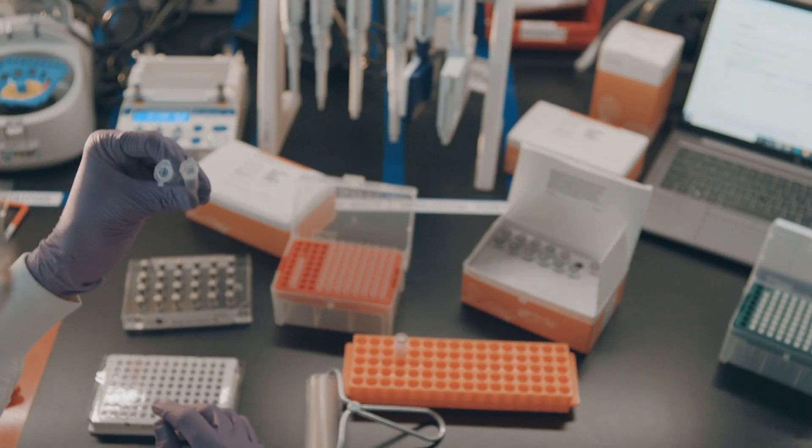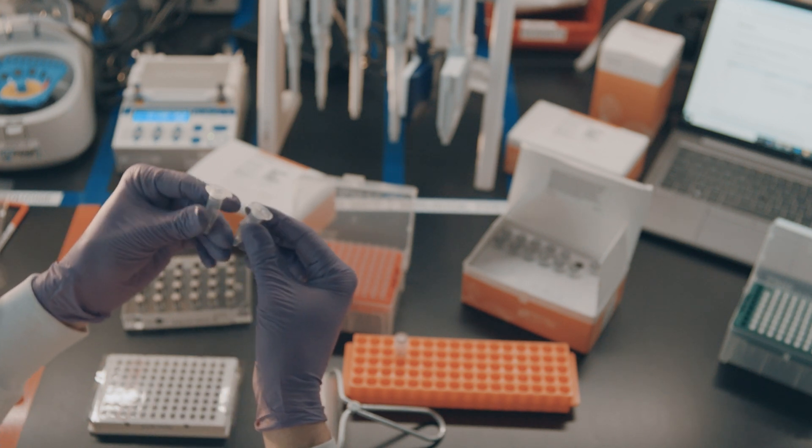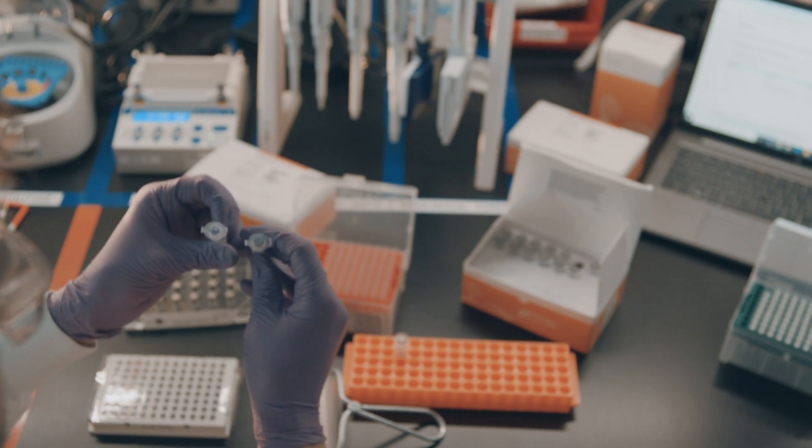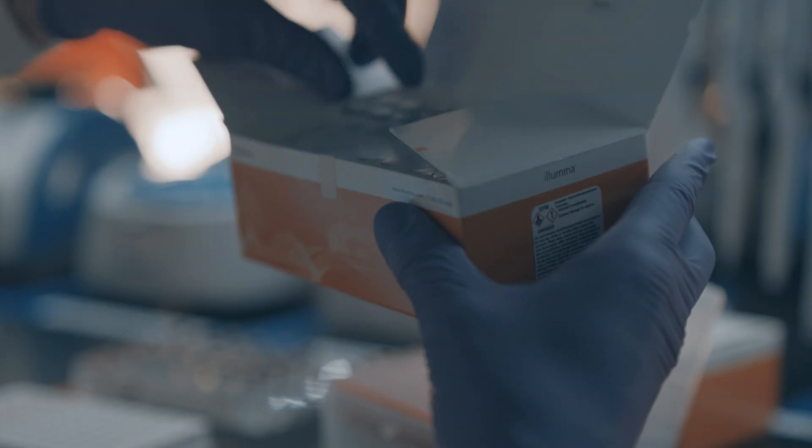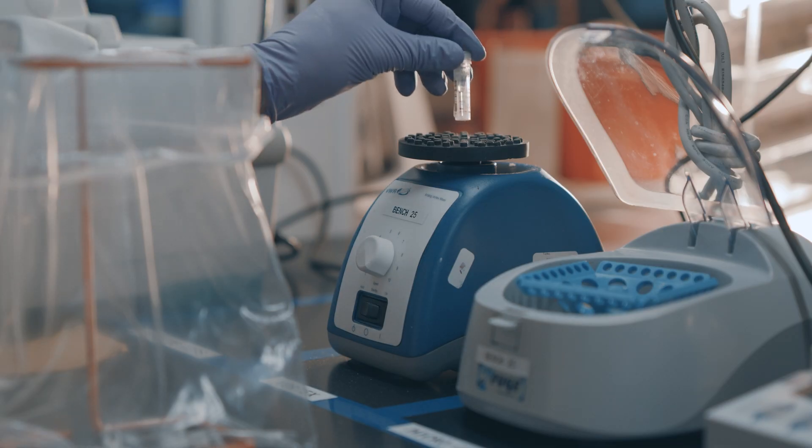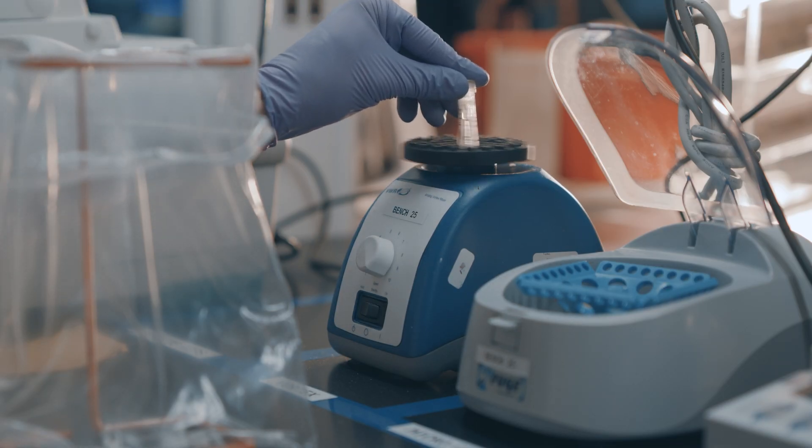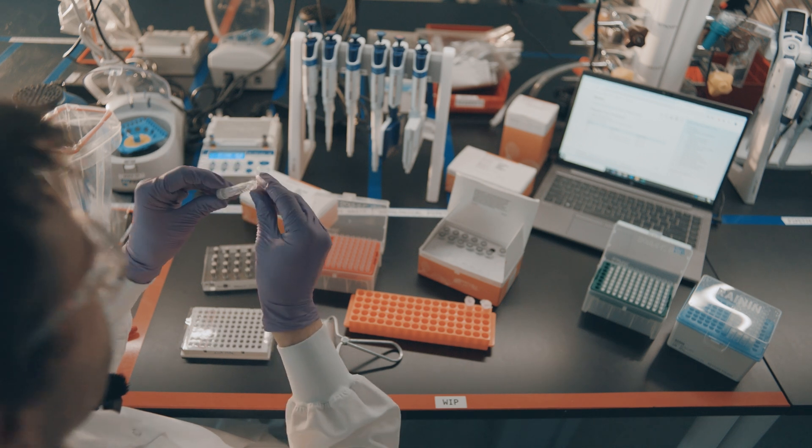Once first strand synthesis has been generated, primer pools are used in two separate amplicon PCR reactions to amplify the regions of interest. One tip the user should keep in mind is to make sure that the Illumina PCR mix or IPM is completely mixed and that no precipitate is visible. This may take several rounds of vortexing to achieve.